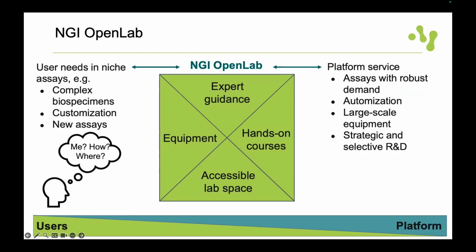Exactly for the single cell part here in Uppsala. So we have opened this in Uppsala. It's planned to open also in Stockholm, but their space is needed to actually be able to do it. The pilot platform is here in Uppsala. But the idea is, we are super curious about this, and we hope also to spread it in different parts of Sweden. But this could be a way to actually do it in Uppsala if you want to, but with support. But the premises need to be thought through, because at the current lab we can't take live cells.